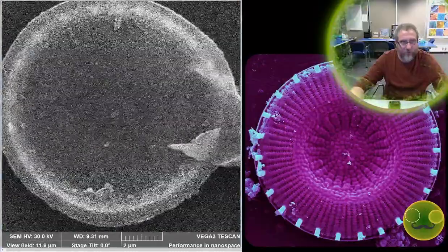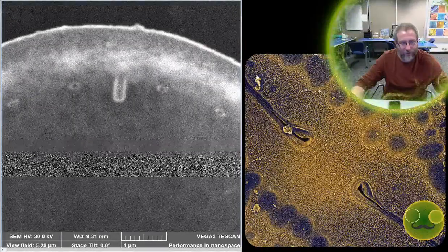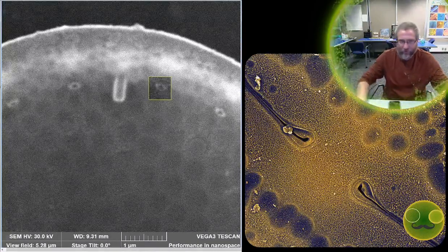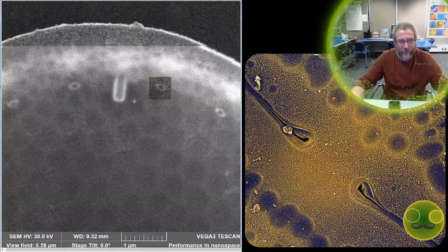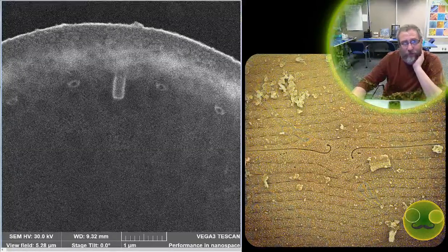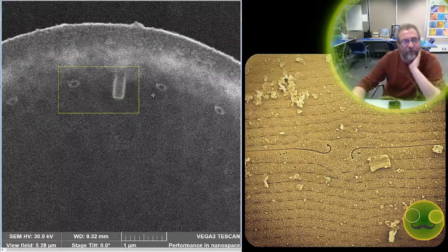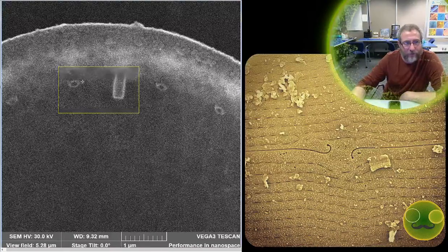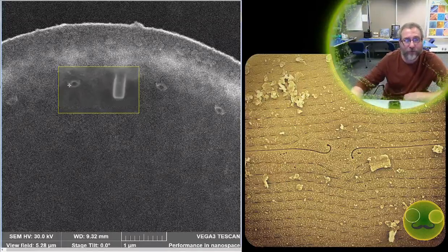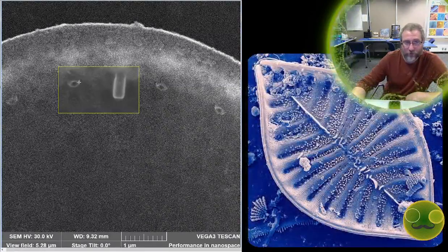And if I zoom in, you'll see it's not very impressive as a feature, but in the diatom realm, when they're looking at these really small things, we determine a lot of the genera and the species based on these really small processes that occur. And this process over here, so a process is basically just something that goes through the valve wall or through the cell wall of the organism. These things over here are called fultoportulae, or sometimes referred to as strutted processes.